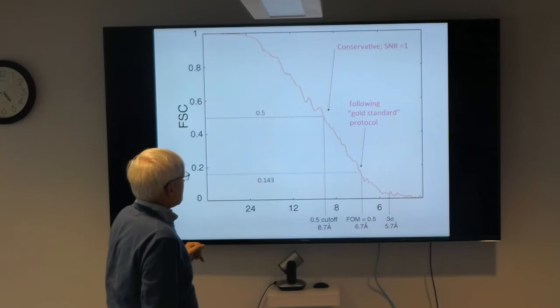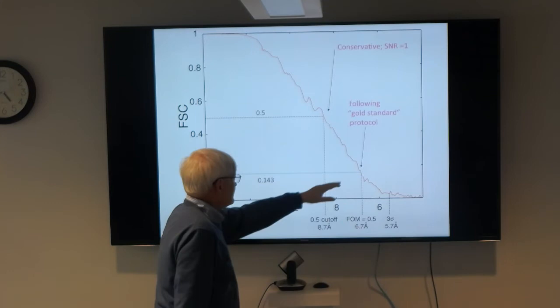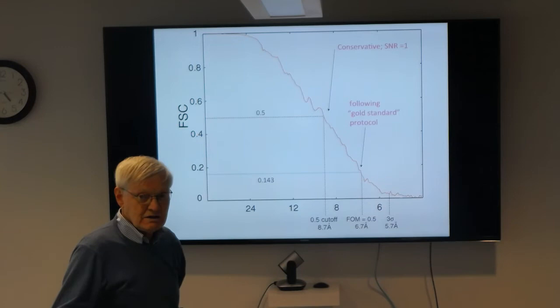And then there's the curious thing of 3 sigma, which was propagated by some people, and it didn't make any sense. Okay, so just go by this, but make sure that the data sets that you compare are independent.